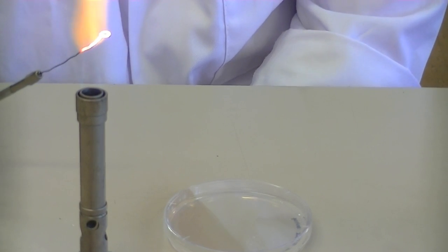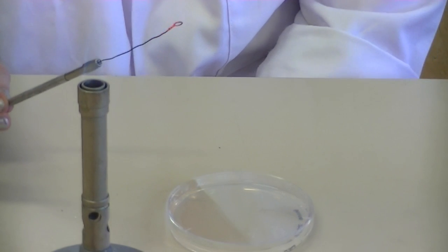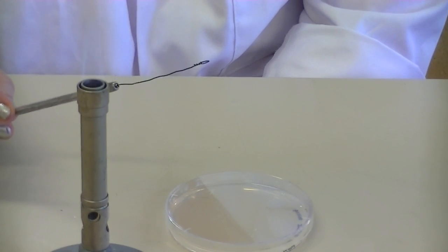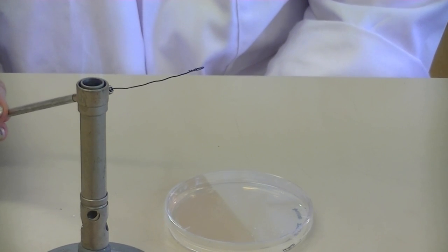Once you've transferred it, you need to flame your loop again to ensure that any excess bacteria is removed. Remember, the purpose of the streak plate technique is to dilute the cells, so we're removing any of the cells that might have been on our loop.